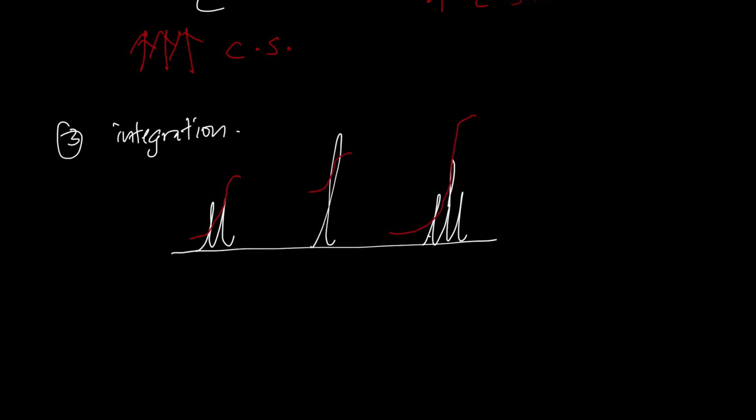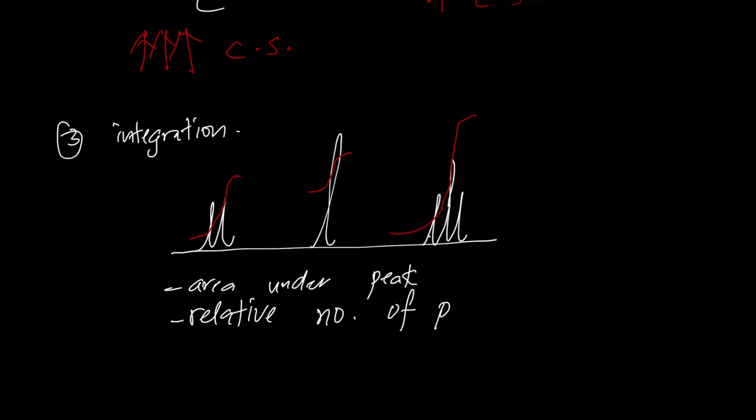Integration is actually the area under the peak, under the signal, and this integration tells us the relative number of protons that are responsible for each peak, each signal.